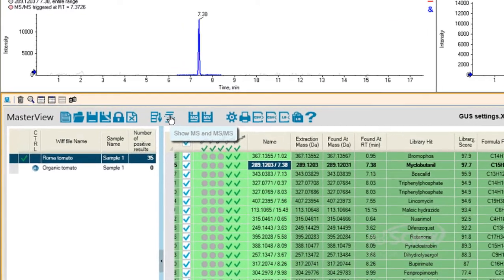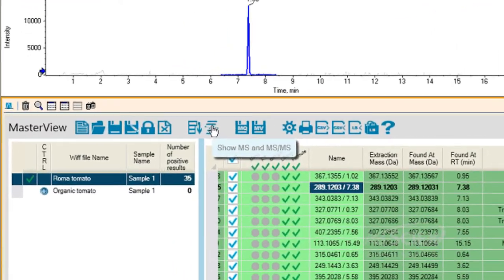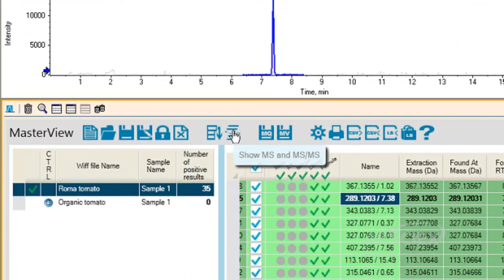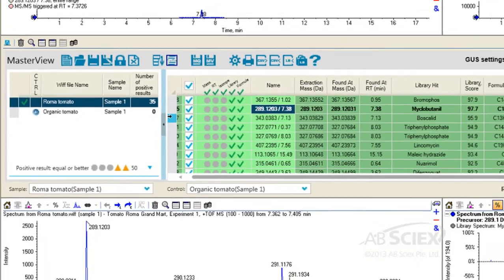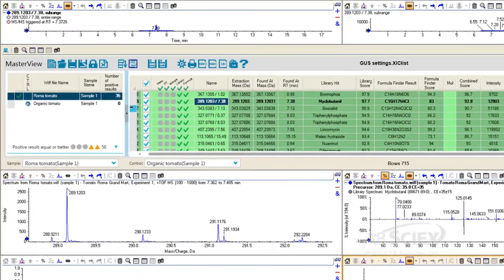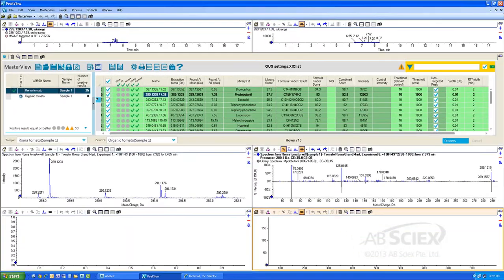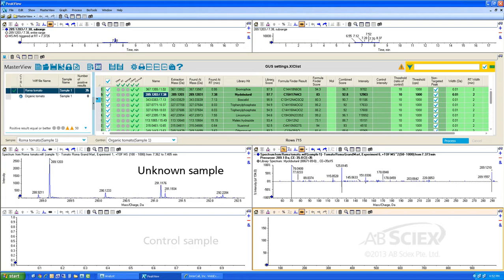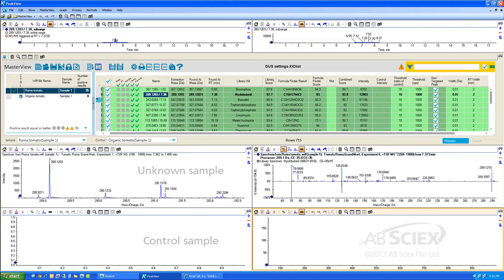We can also review the MS and MS-MS spectra for these peaks by selecting the Show MS and MS-MS icon. In this view, the unknown sample is shown as the top two spectra and the control as the bottom two. You can see that nothing is displayed in the control sample since this chromatographic peak was only identified in our unknown sample.